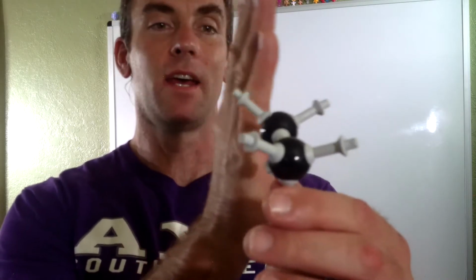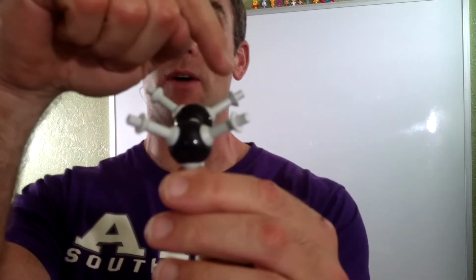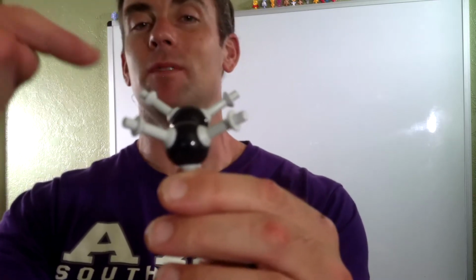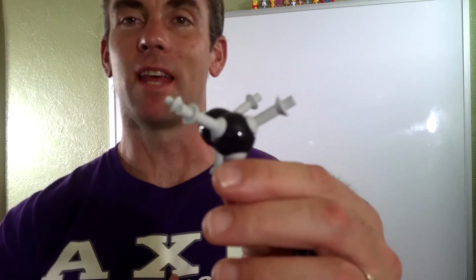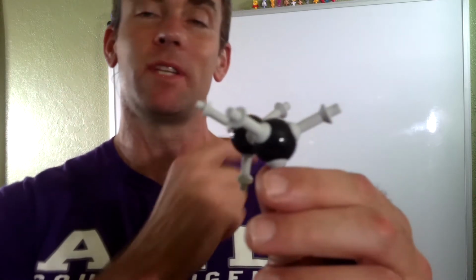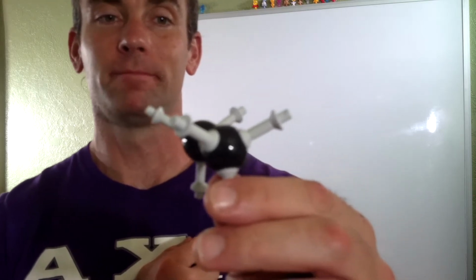By the way, other symmetry planes are going to play a role, not so much in this carbon one, but you can see that there's also a symmetry plane that takes this thing and divides it in half. So this hydrogen is equivalent to that hydrogen, which is also equivalent to that hydrogen, and so on. Eventually you recognize that there is 1 hydrogen type of environment and 1 carbon type of environment. This particular presentation will concentrate on the carbon side of things.